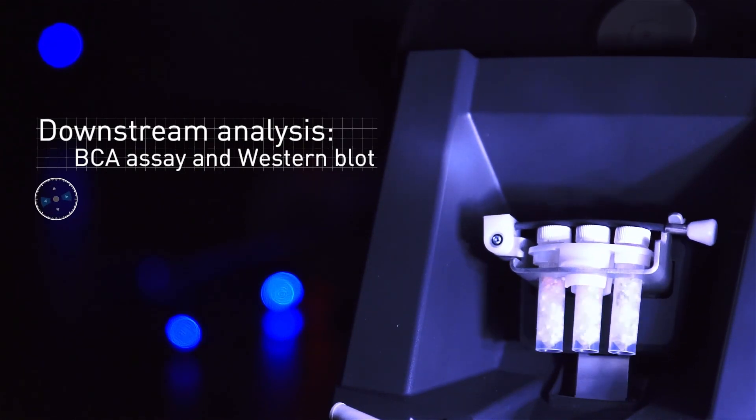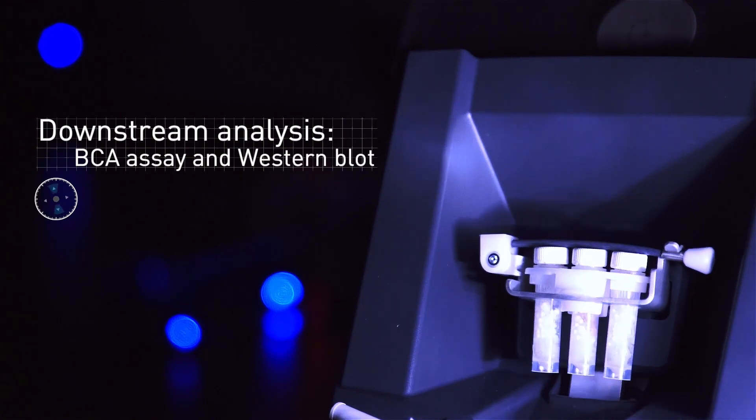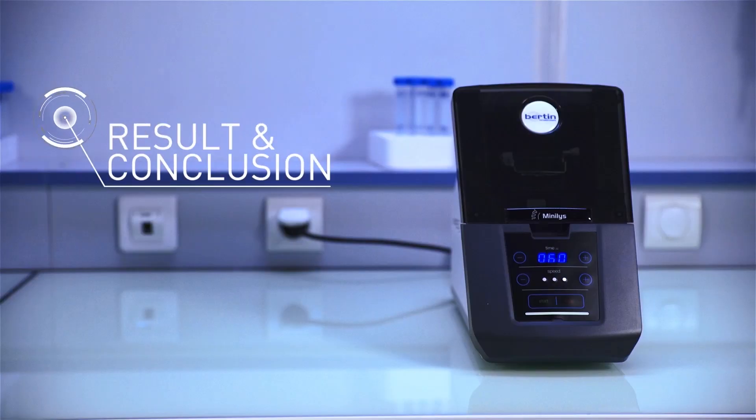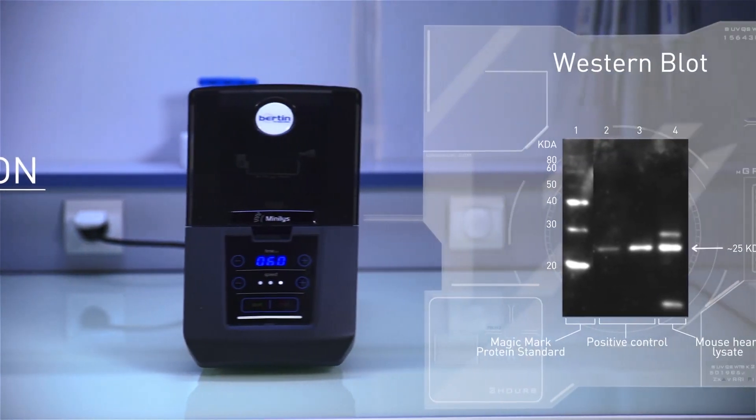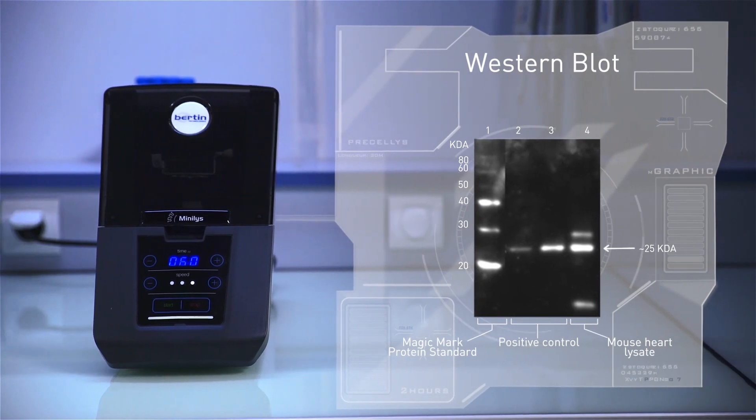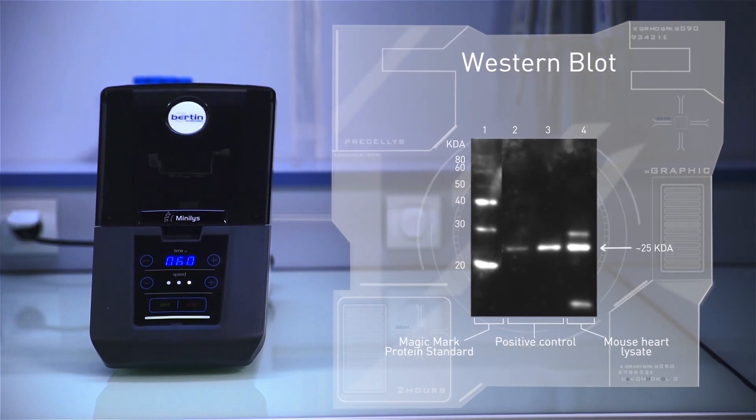The expression of sphingosine-1-phosphate receptor 3, a membrane receptor, is analyzed. Lanes 2 and 3 are loaded with S1P3-transfected HEK293 lysate, which serve as positive controls. Membrane proteins extracted using the mini list are run on lane 4.